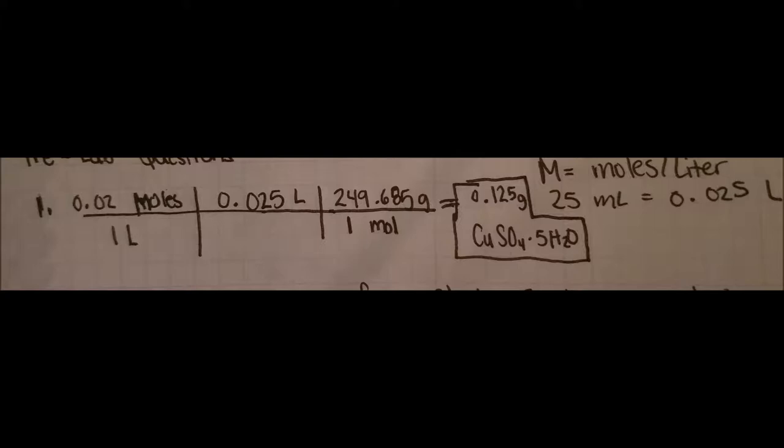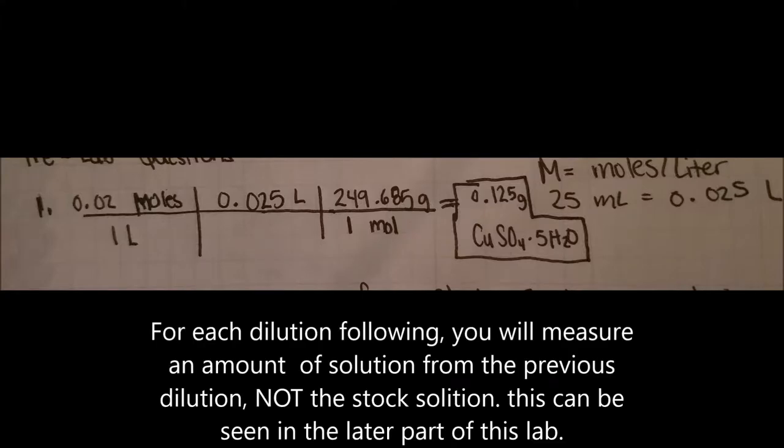Next, add more water until the meniscus rests on the line of the flask. Place the top on the flask and mix the solution. Pour into a clean beaker. This is the stock solution. From the stock solution, you will make dilution one.